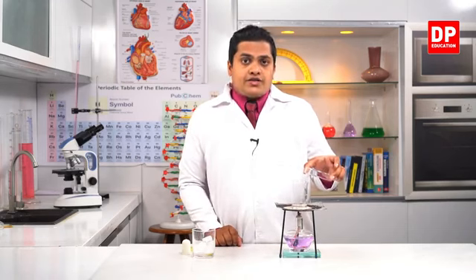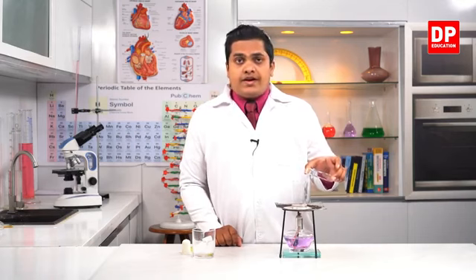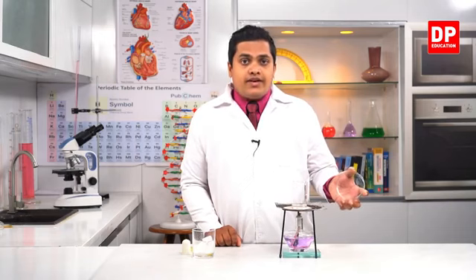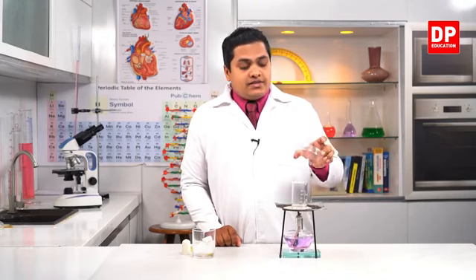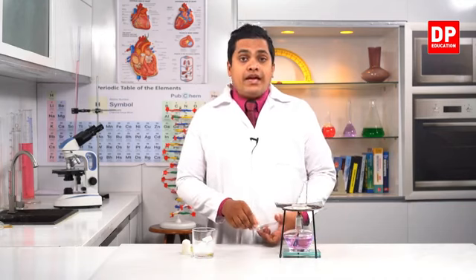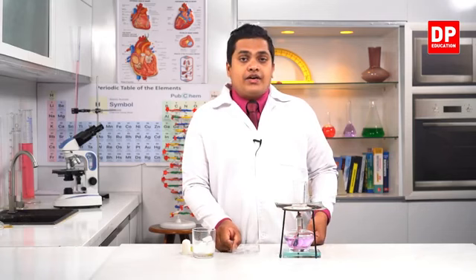This state change is specially referred to as condensation. So here we can say that water vapor has condensed into water droplets when I am placing this petri dish above the beaker, right? So these are some examples where we can observe the state changes in matter.